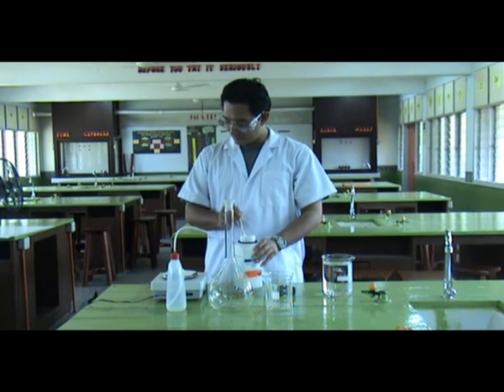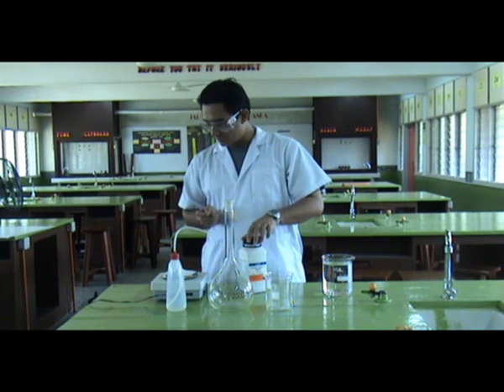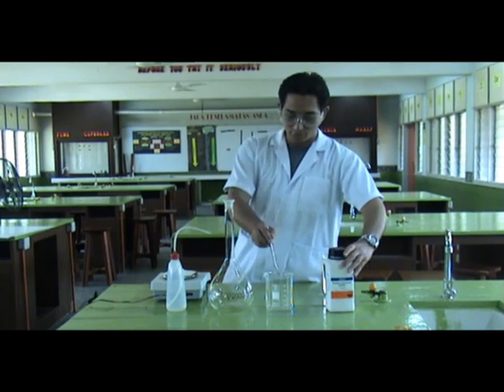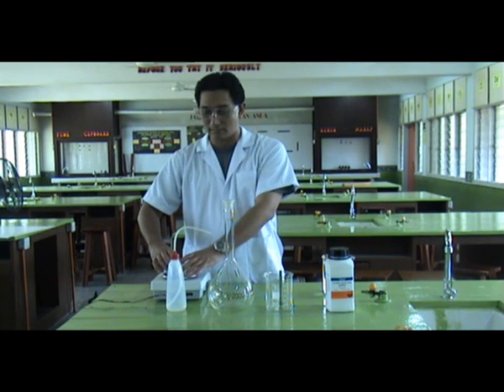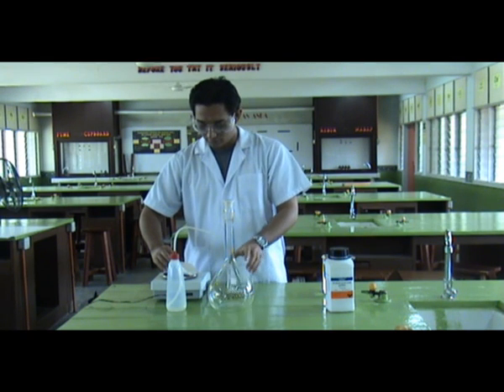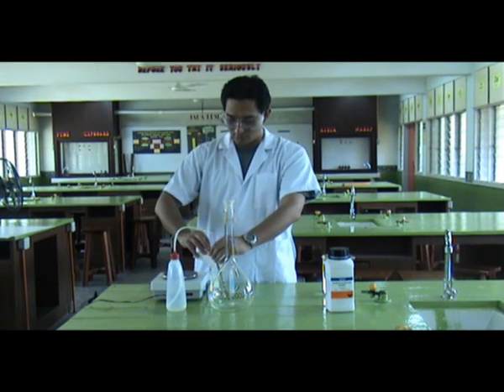Now I already have about 40 grams of sodium hydroxide measured on the scale. So the next step is we are going to add this portion of sodium hydroxide into a beaker. Carefully take these pellets and load them into the beaker.